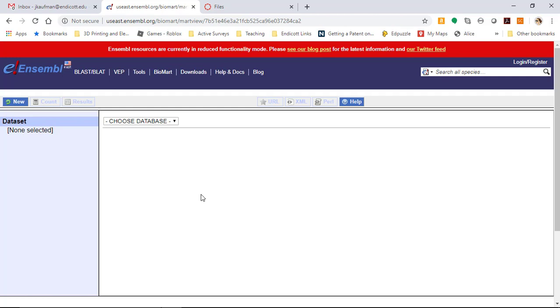One thing you learned last week is what data 23andMe sends to individuals when they ask for their raw data file. It's very simple, only four columns: you get the RSID, the chromosome, the base position, and the genotype. There isn't any information about what that genotype means. The BioMart tool is the database where we're going to get the information about the meaning behind each SNP.